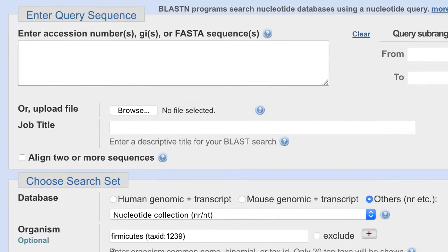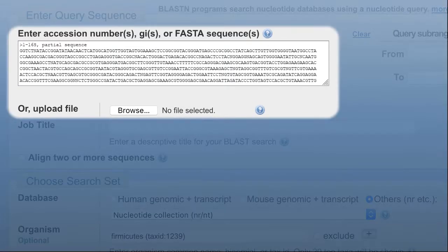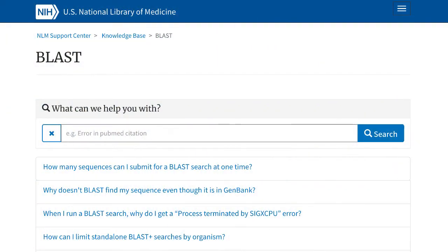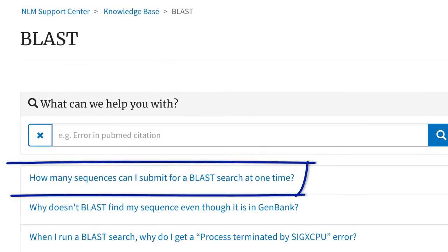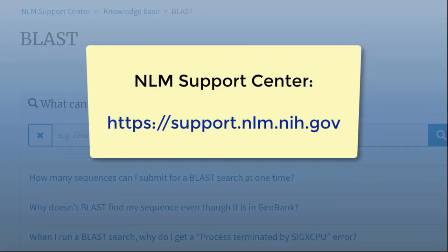One advantage of searching the smaller 16S database is that you can likely submit more query sequences in a single search. To learn more about how many sequences you can submit, see the BLAST entries in our online support center at support.nlm.nih.gov.